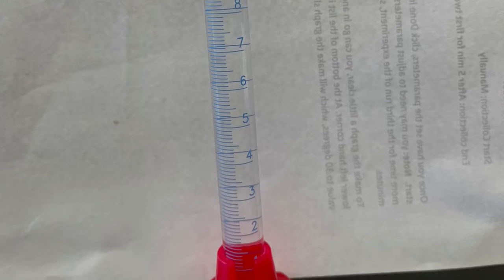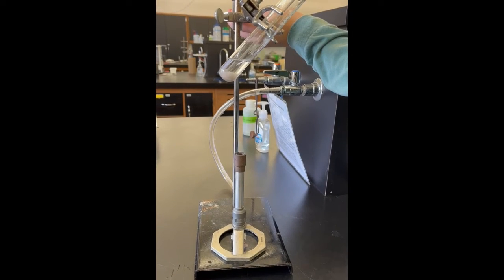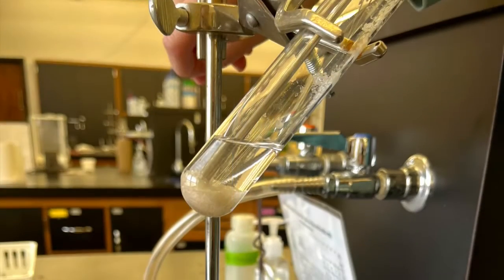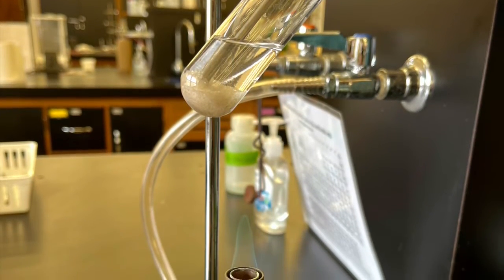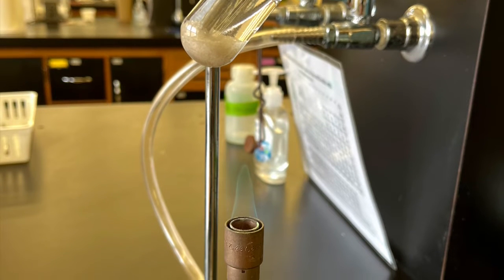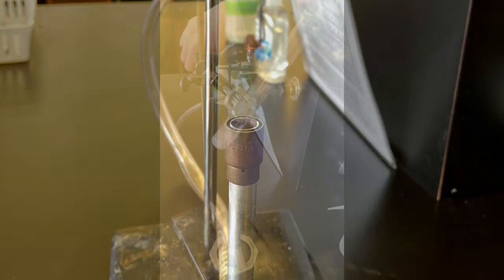Measure out the initial quantity of deionized water and add it to the salt in the apparatus. Clamp the test tube as shown in the figure in your lab notebook and heat it with the Bunsen burner, making sure to stir continuously as you heat it. Make sure that you have a cool light blue flame. It should not have a double cone.